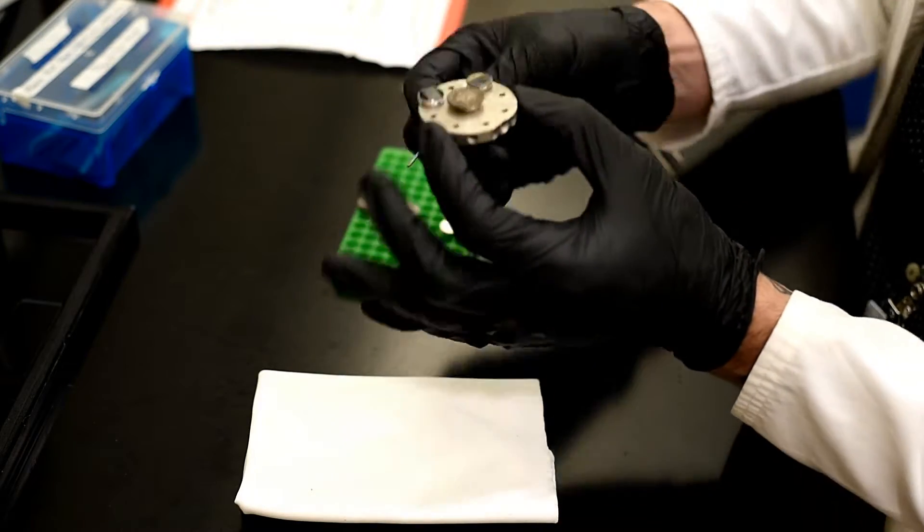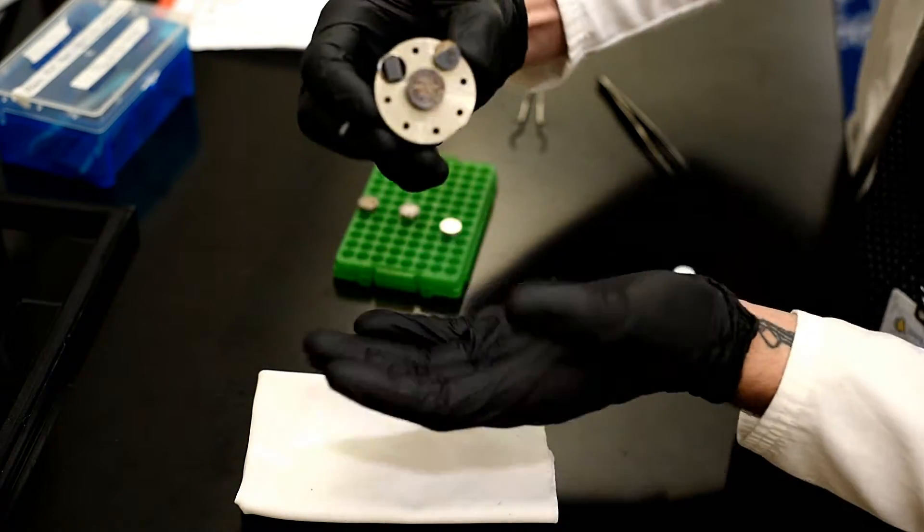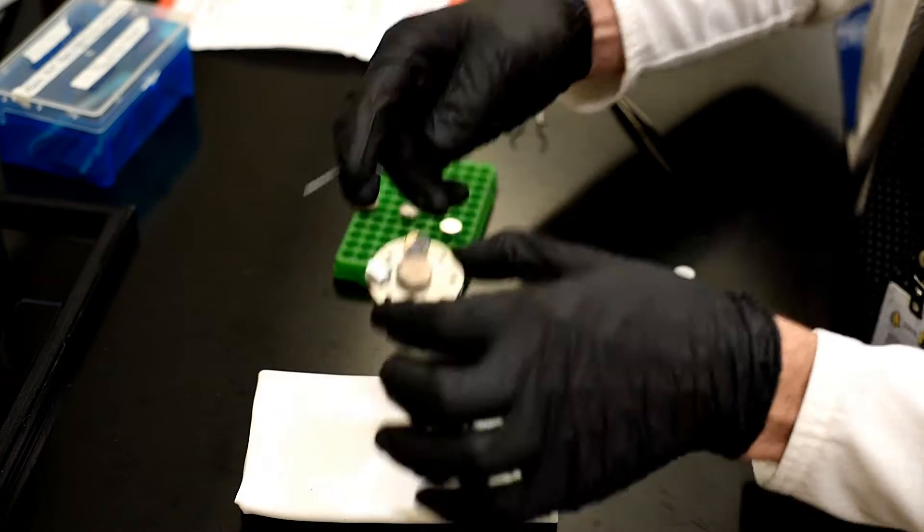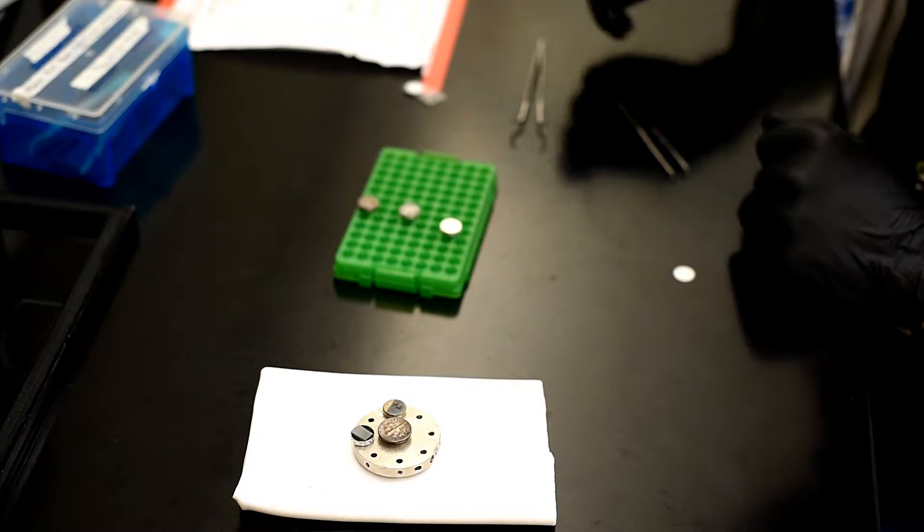So now I'll turn that upside down. They're all ready to go. So now we can load this into the SEM.